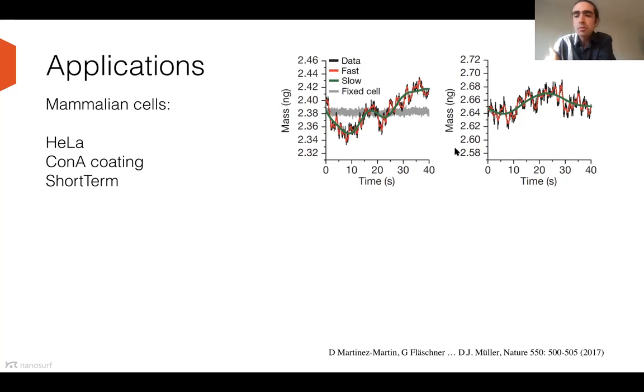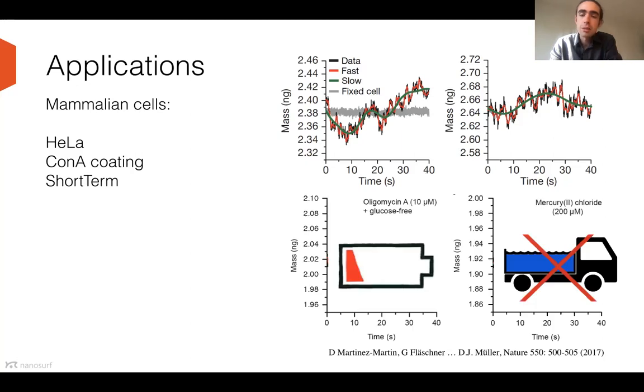And what you can also see is the actually very interesting bit. If you wonder, what is happening there at such a short time scale? Well, we found that out by actually depriving the cell of its energy.